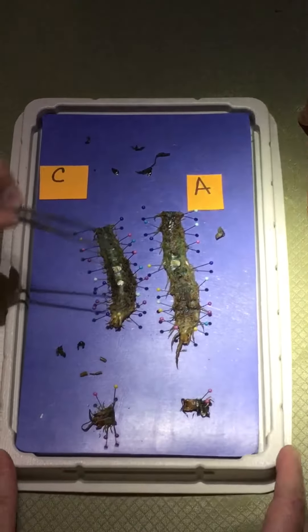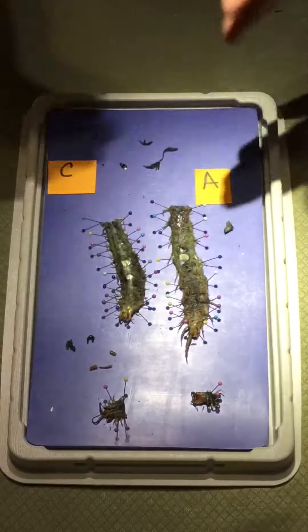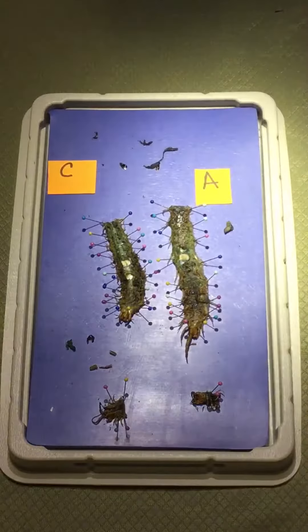The main thing I am concerned about right now is that we found the heart in A, but in C there was no heart. So if you find a centipede and you can't find the heart, please let me know.